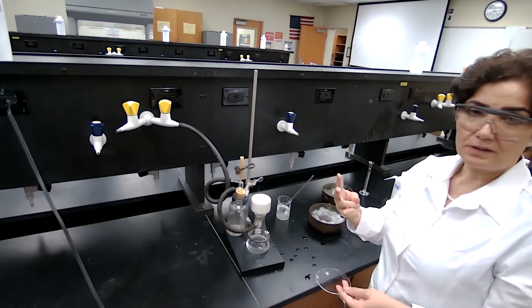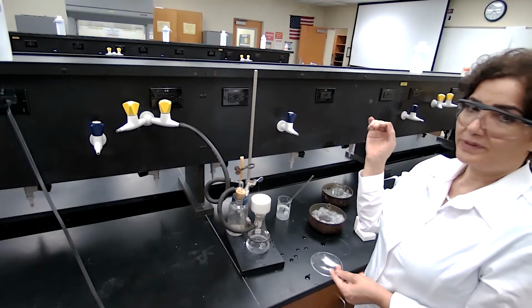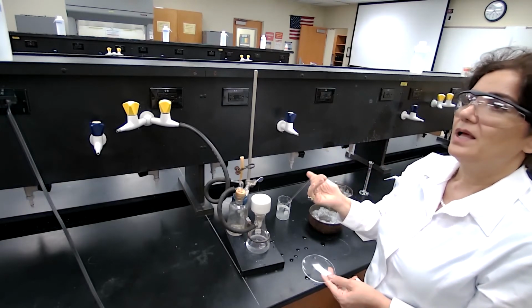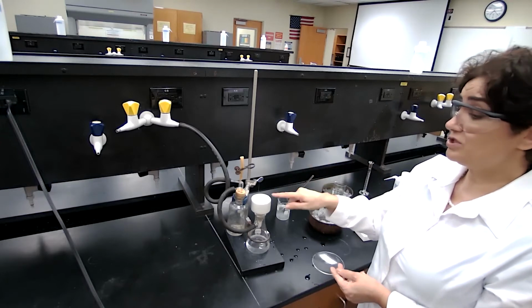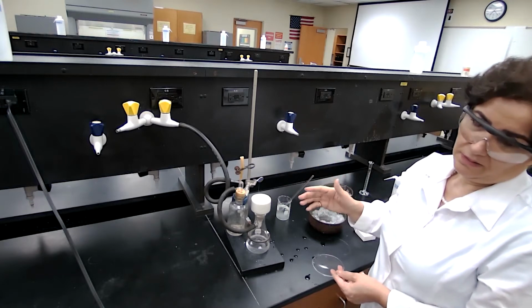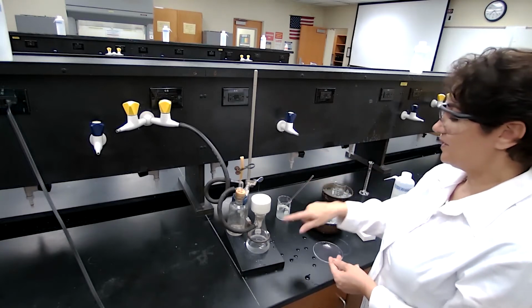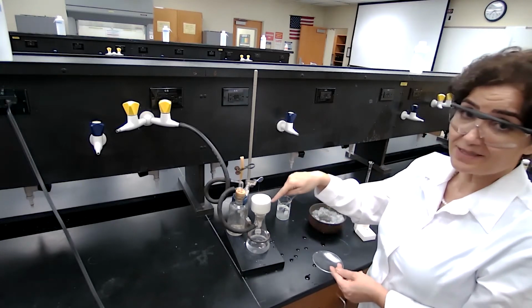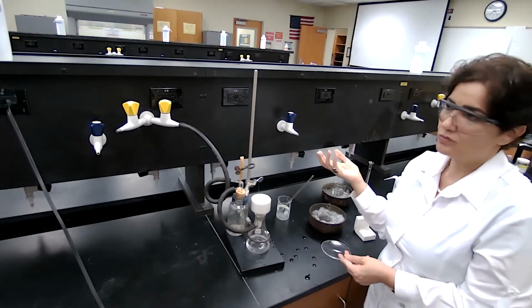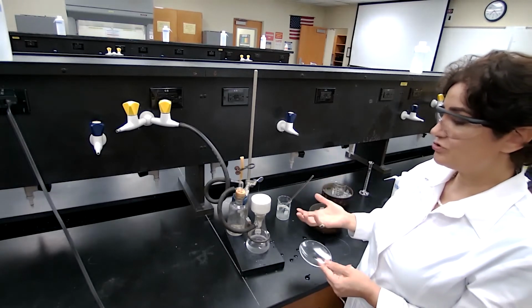Two options: leaving overnight to dry, or leaving in the oven with the temperature setting of 102, because the literature value for the melting point of the acid is about 120. The boiling point of the solvent that I washed last is 100 degrees Celsius, so I'm setting it at 102. And I will leave it there for a few minutes until it's dry.